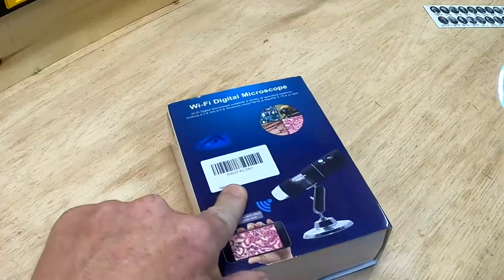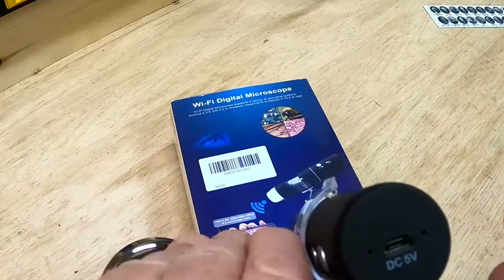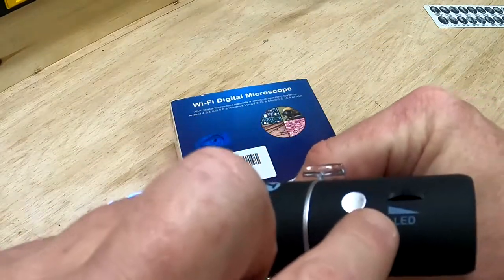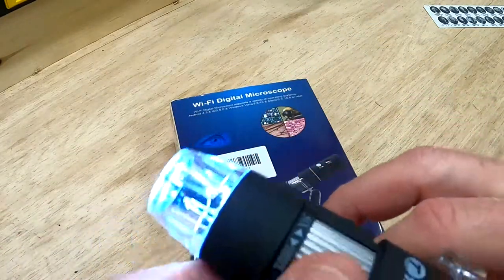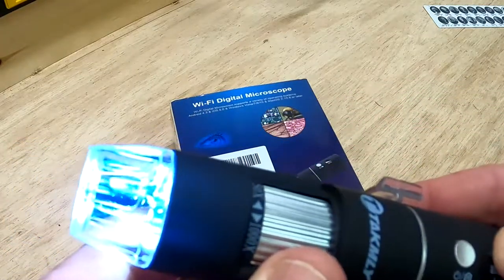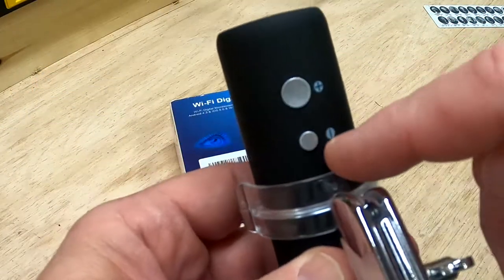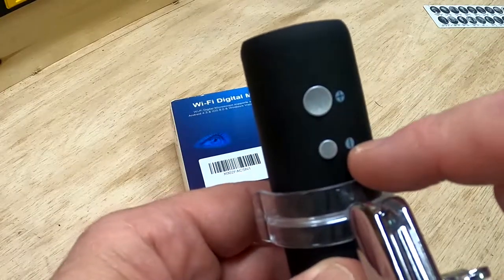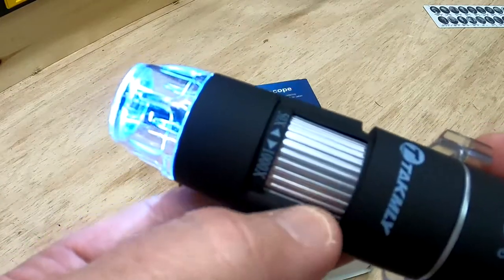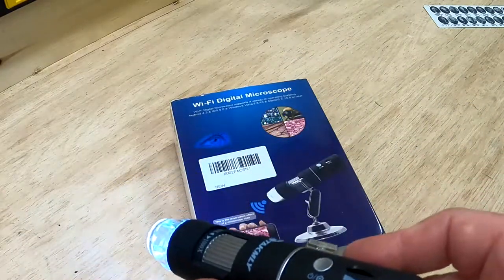It comes in this package. It has a built-in battery and you charge it through the five-volt USB charging port. You can turn it on and off, there's an LED built into it, and this little slider lets you change the intensity of the light — I tend to keep it at full intensity. You can control your zoom with plus and minus buttons, and you control your focus with this ring that turns.